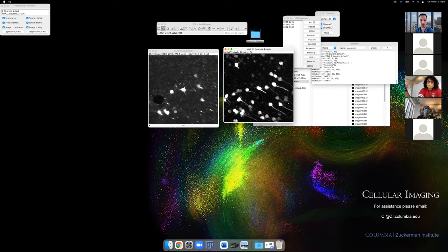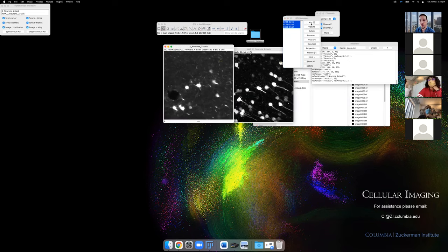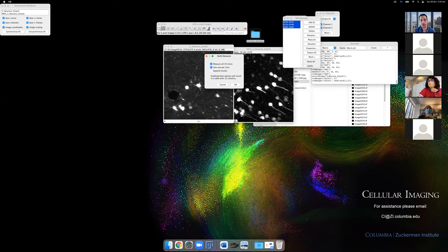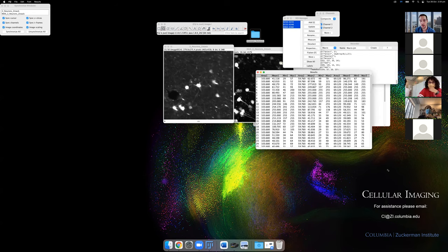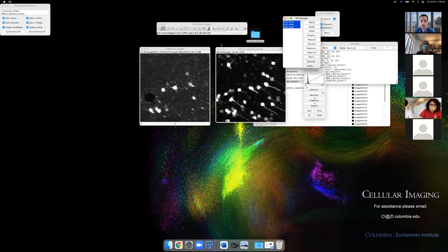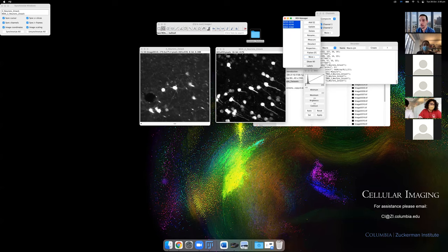A great example is with time series data: create a maximum intensity projection, pick up where all the cells are, and then use those ROIs on the time series. Under More in the ROI Manager, there's a Multi-Measure function — run this and it will measure the intensity of those cells across the whole time series, giving you a table of time point and mean intensity for each cell. This can be very quick compared to doing it in other software.